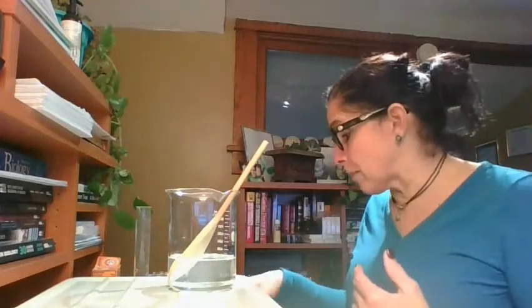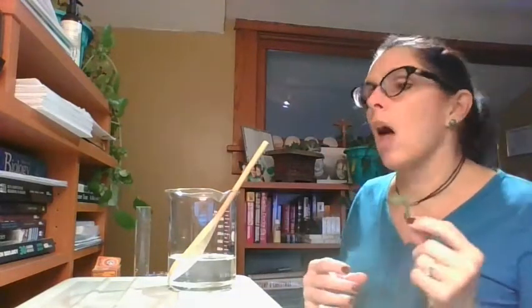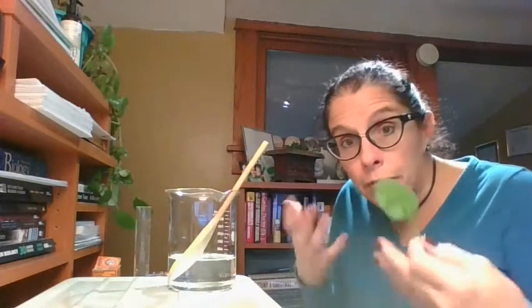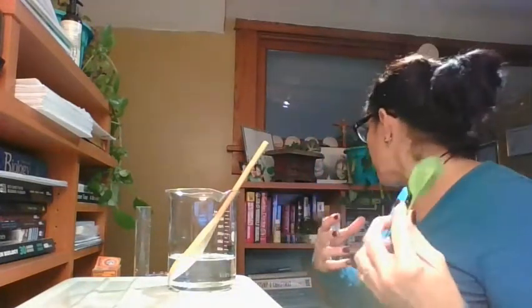My next job is to get my leaf discs ready. I have a spinach leaf, which I got at Kroger. A lot of the things we do in my class, I buy my ingredients at the grocery, because life science is living things, plants are food, and food is at the grocery. A lot of our experiments we can model with plants.